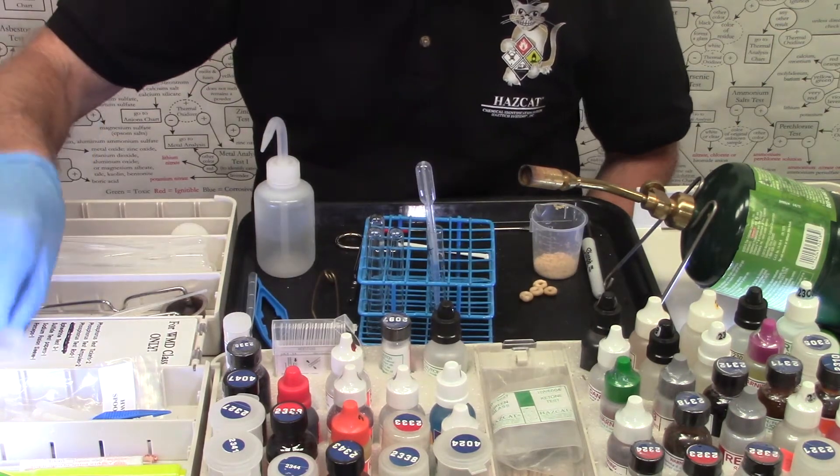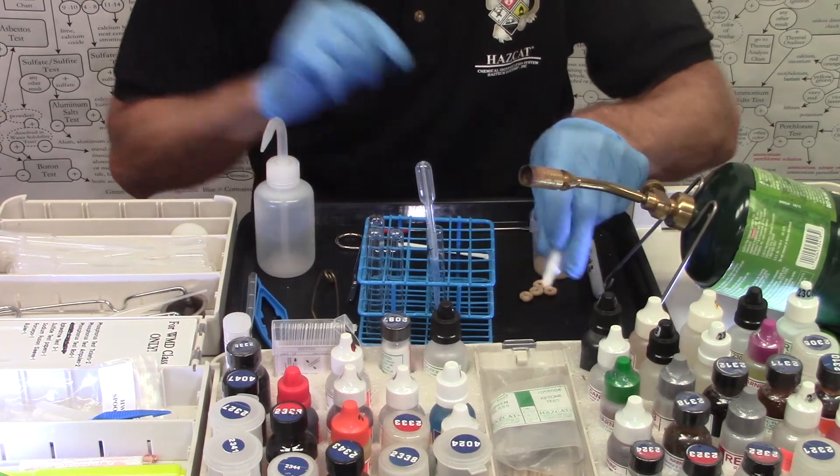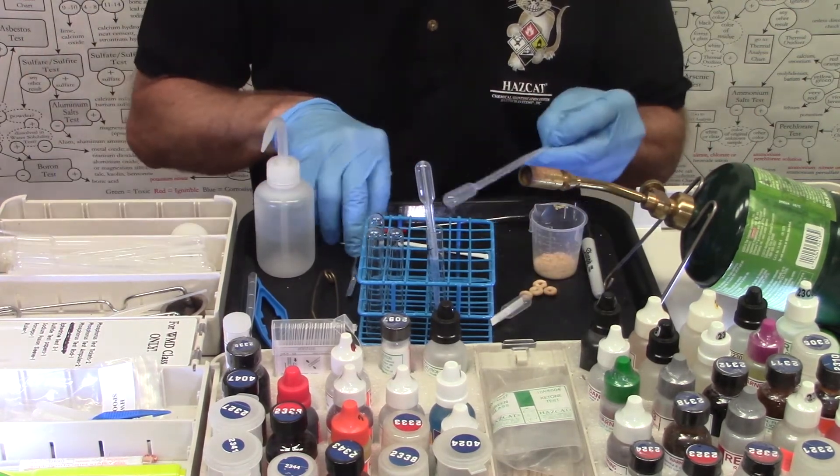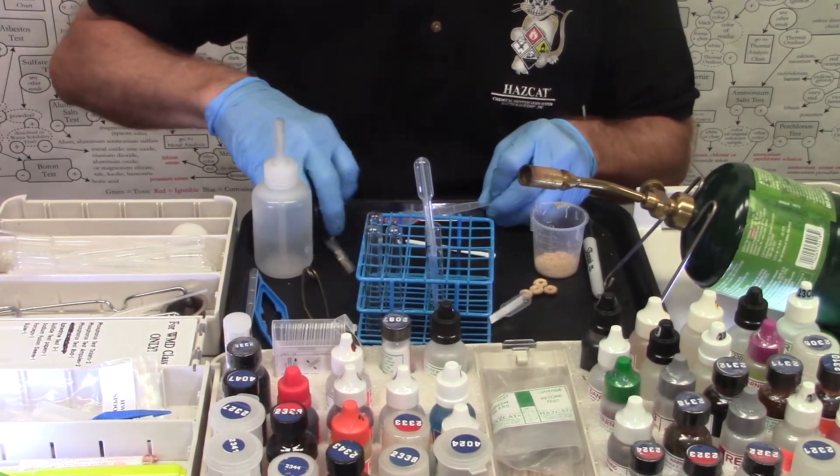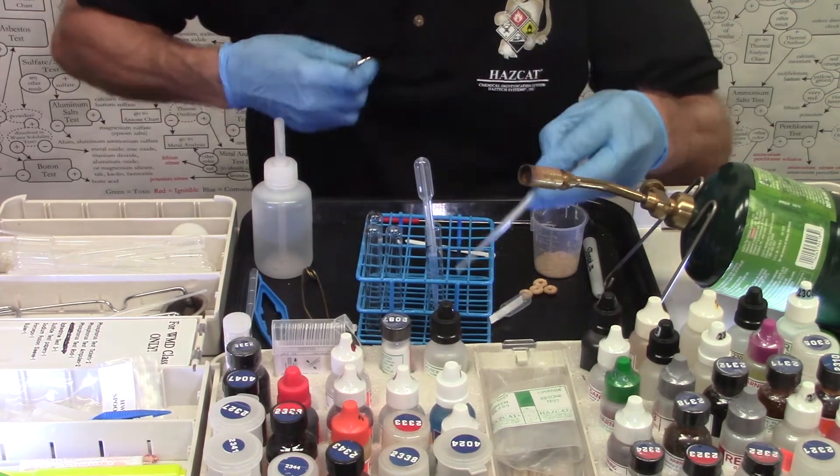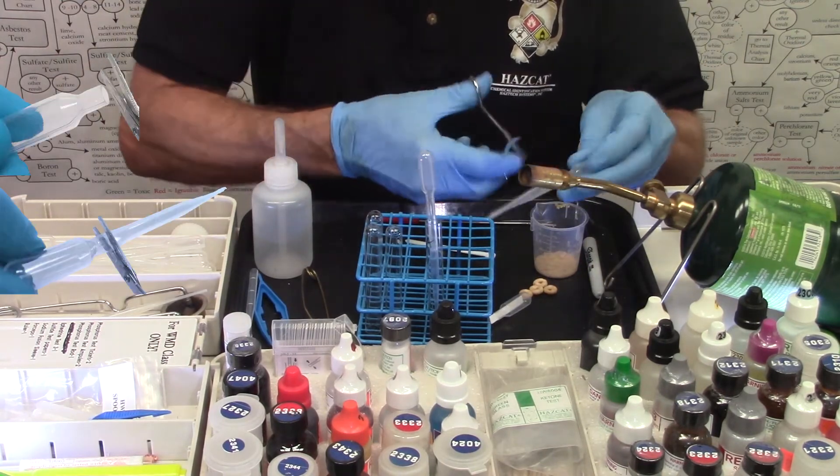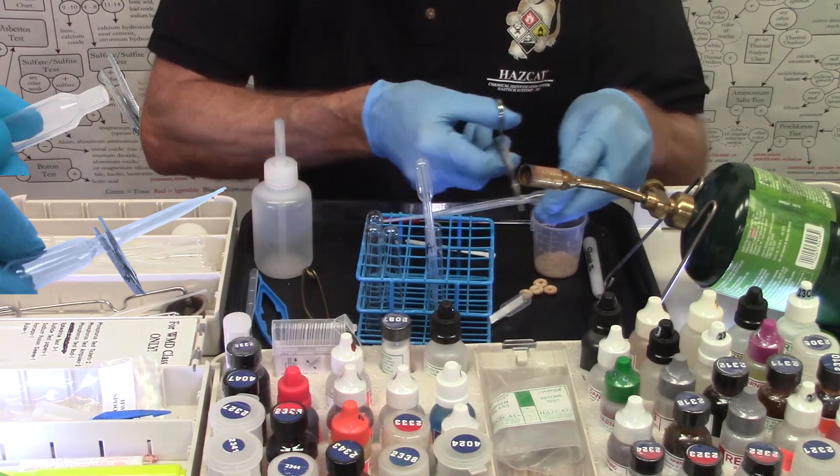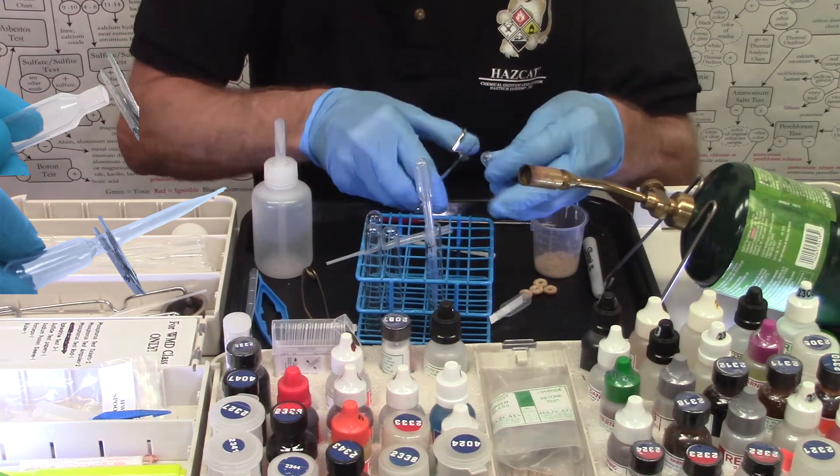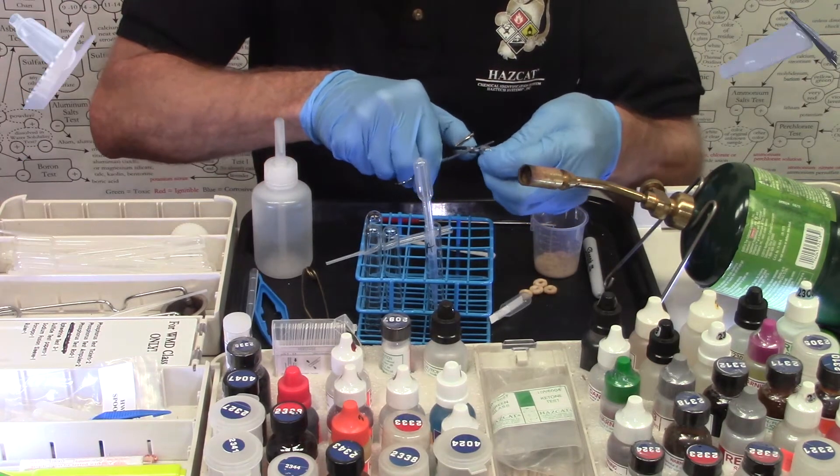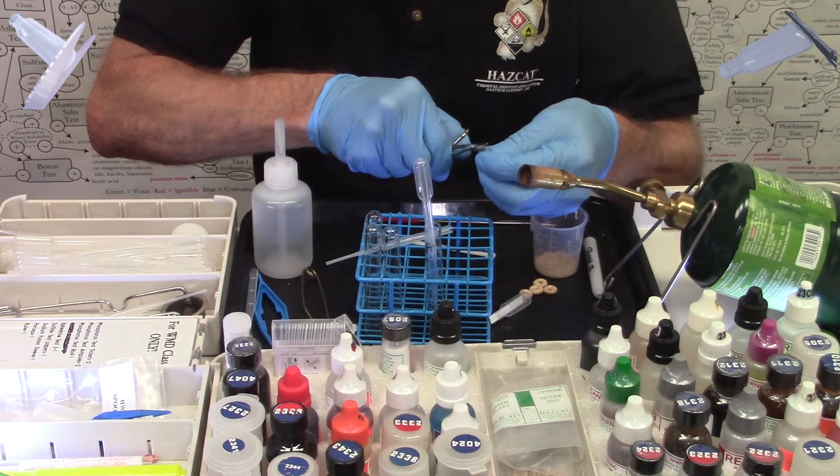Now we're going to prepare our gas collection bulb. It's going to look something like this. I made that by taking a pipette, cutting off the stem at the first graduation mark, cutting a small slit in the top, just enough for a gas to escape.